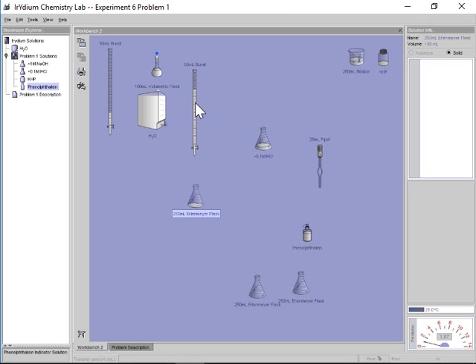Because these concentrations are roughly similar, if I have 25 mils of my acid, I know it's going to take approximately 25. Maybe I'll toss in 20 mils safely, and I'm going to toss in maybe 0.5 at a time, and then slow it down to 0.1 at a time if I can, as I'm getting close to the 25 mark. So just to show you here, I'm going to pour the burette. This is my new diluted sample of NaOH. I can always dilute some more if we wanted to. So I'm going to just pour this in.